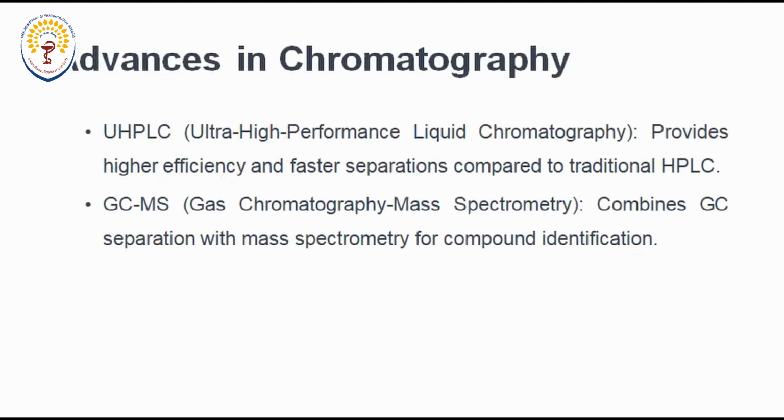Now there are advances in the chromatography field. Advances in terms of the instruments that we are using now. Instruments which we use now are very sophisticated. They have high selectivity. They are also very powerful. They have very high resolution. Their sensitivity is very strong, and they are able to identify very small amounts of impurity, and they are also faster.